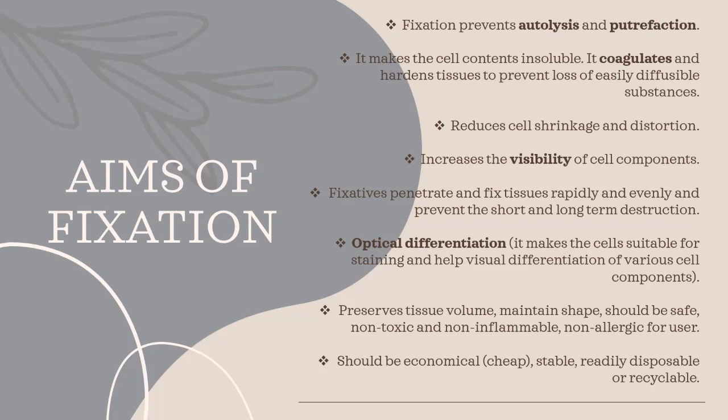And fixation preserves tissue volume, maintains shape, and the fixatives should be safe, non-toxic, non-inflammable, and non-allergic for the users. And the fixatives should be economical, stable, and readily disposable and recyclable. So these are the aims of fixation, and if we do fixation, we should take these points into our consideration.